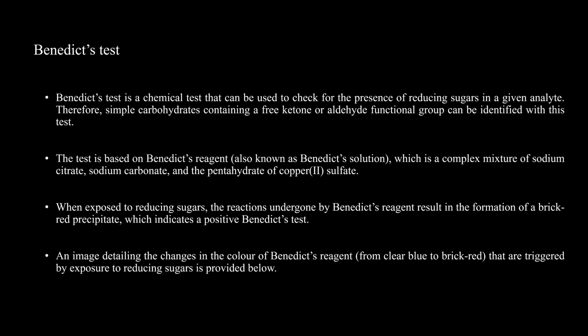Copper sulfate pentahydrate. On exposure to reducing sugar, the reaction undergoes Benedict's reaction, resulting in the formation of a brick red precipitate. The image details the change in Benedict's reaction from clear blue to brick red that occurs on exposure to reducing sugar in the blue solution.